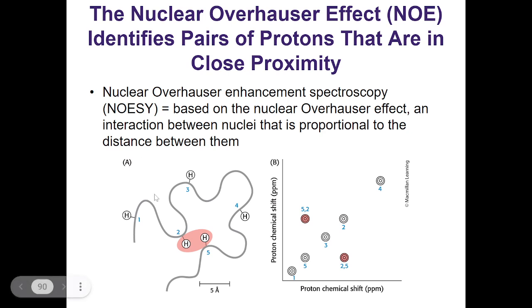Yeah, and so what that does for you is, number one, you can tell where the hydrogen is based on its chemical shift. Is it near carbonyl? Is it near nitrogen, right? And then secondly, you can tell how close those hydrogens are together. You can also do this for things like carbons, nitrogens, oxygens. You could do this for irons, by the way, for like hemoglobin, right? And so you can actually do this for a lot of different groups.